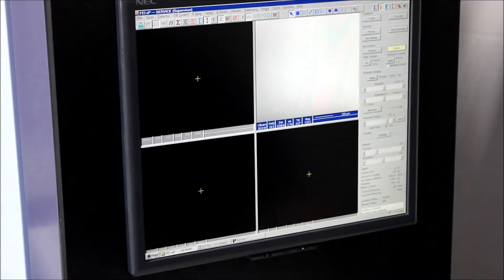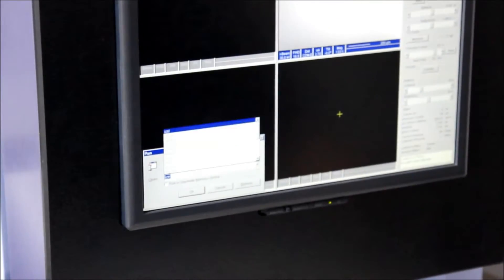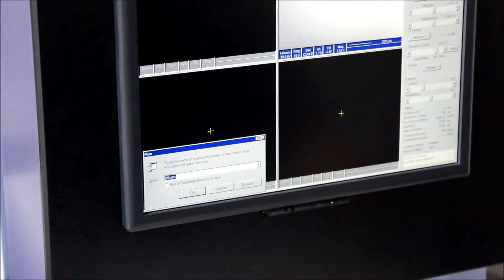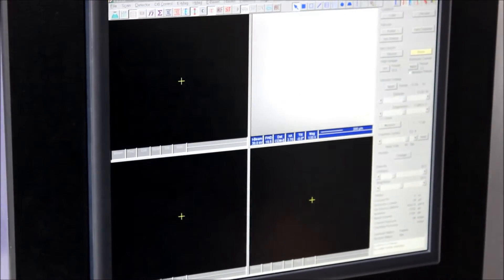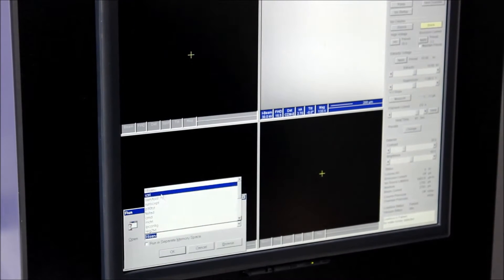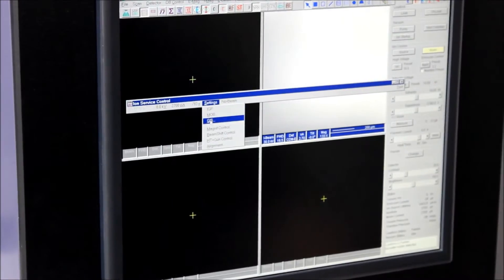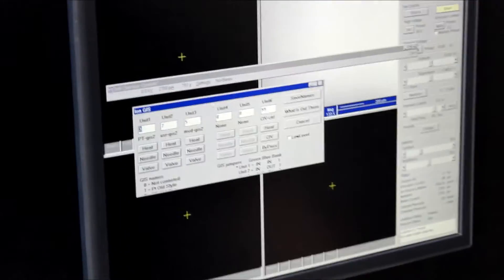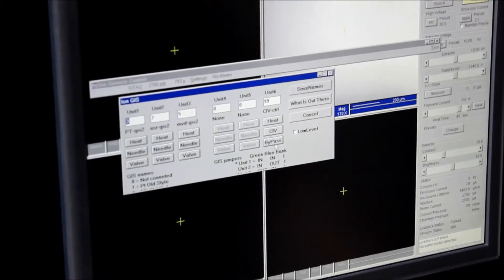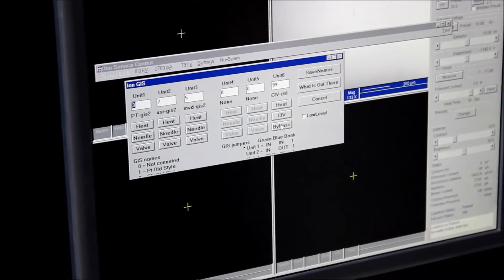Once all these are turned off, you'll go ahead and run — if it's not running already — 16serve. I'll throw an error because ours is already running. Then you can run eye control and this window will pop up. What you'll look for here is in settings, you'll go to the GIS page, and there's a button here called bypass.